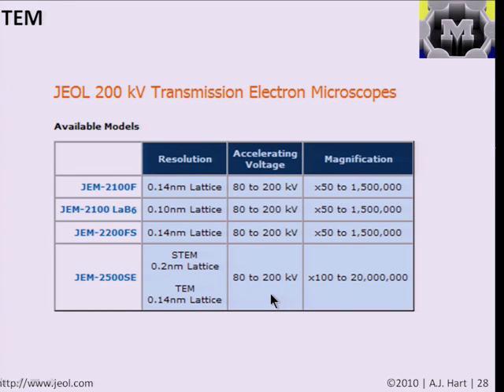So if you have learned or will learn electron microscopy in the future, you'll know that there are a lot of things you can adjust, such as this accelerating voltage and the current that the beam represents, and that can very practically determine, for example, whether you have a better image of the surface or whether the beam is driving a bit down into the surface and getting you more of an image of the bulk. I mean, the bulk is not like going far into it, but whether you're just touching the surface with the beam or you're penetrating the surface by, say, 10 nanometers or so can make a big difference in the way your image looks, and also can let you see what you want to see.